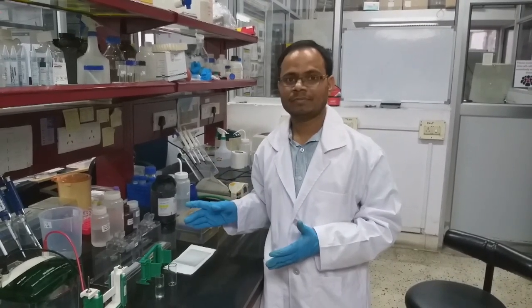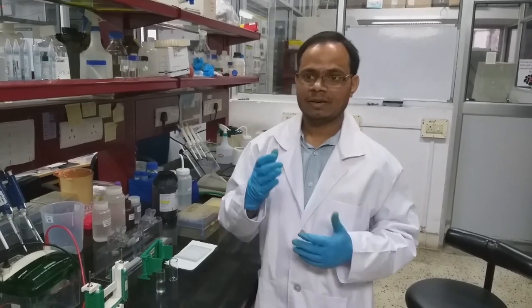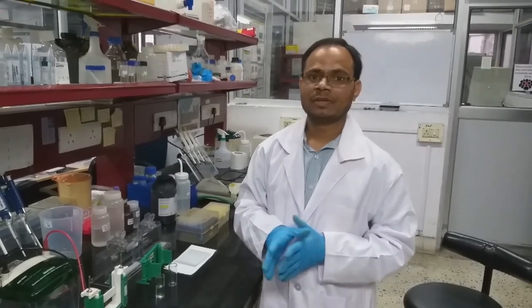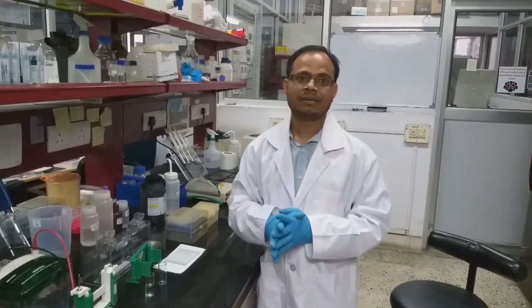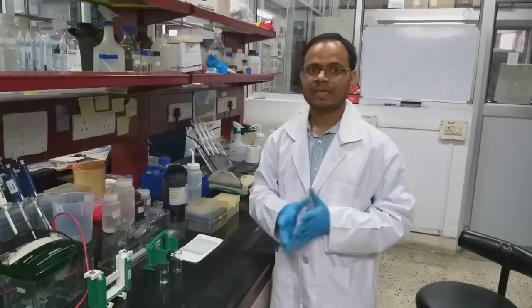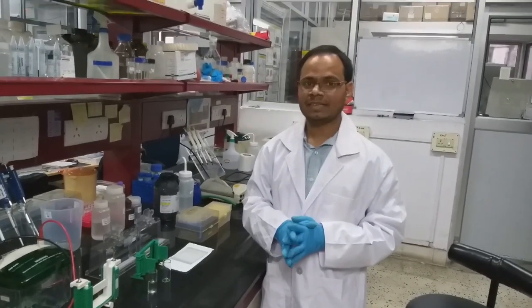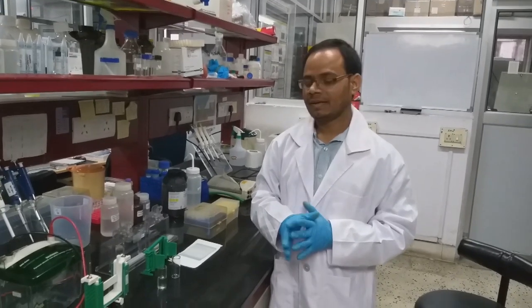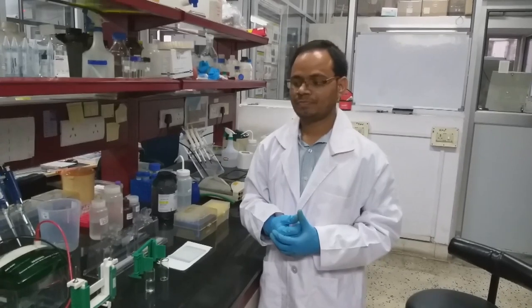After solidifying, we have to prepare the stacking gel. The stacking gel composition is the same, but we can say it is diluted. It contains pH 6.8 Tris HCl and the remaining components are the same, but in lesser quantities.